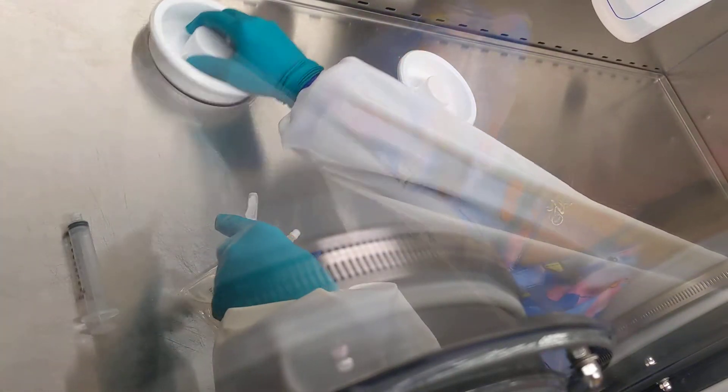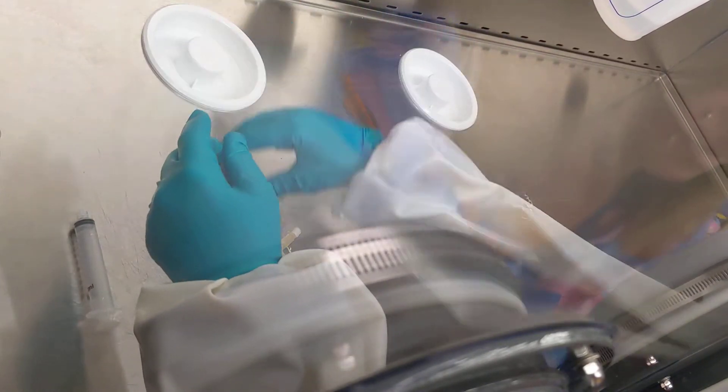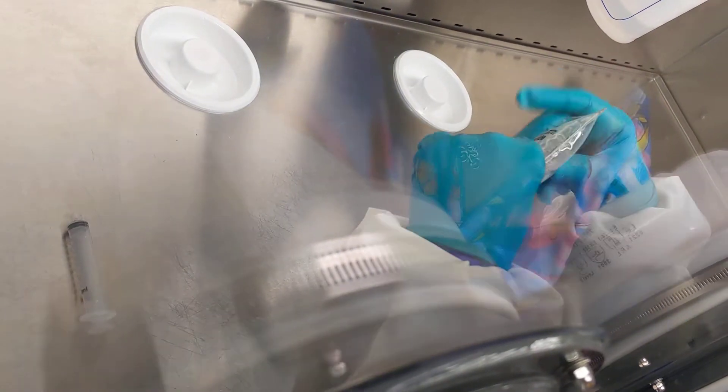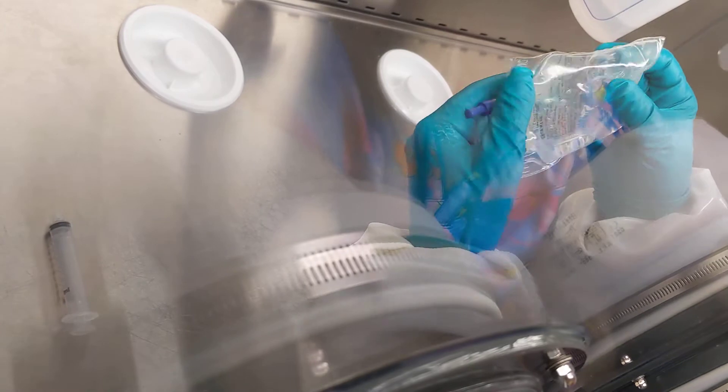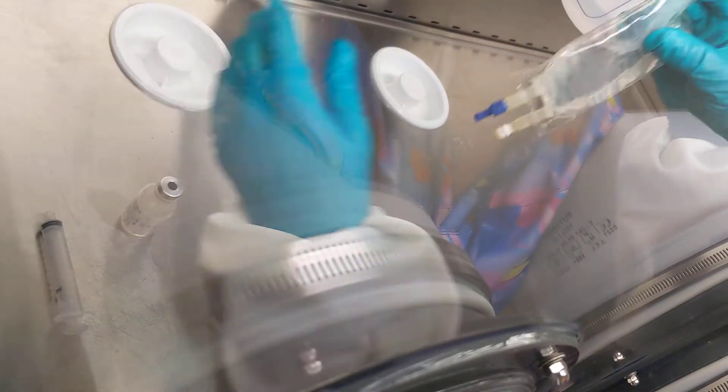We have sharps containers underneath here. You always visually inspect the product when you're done mixing to make sure that you didn't core the top of the vial and now have a piece of rubber floating around in there.